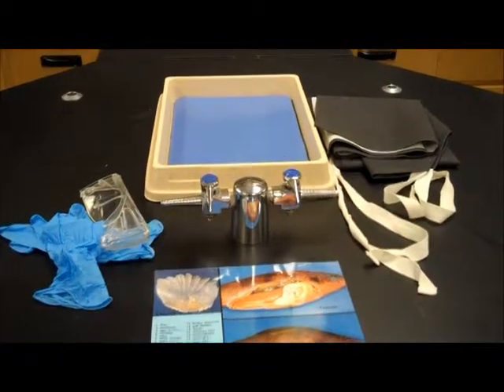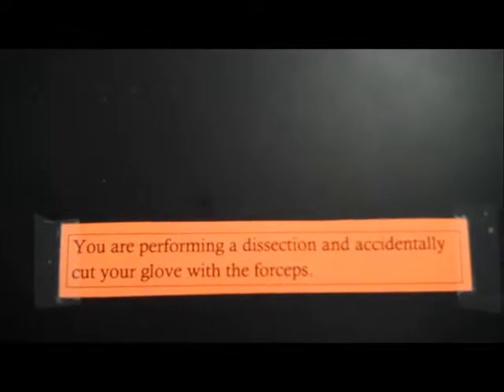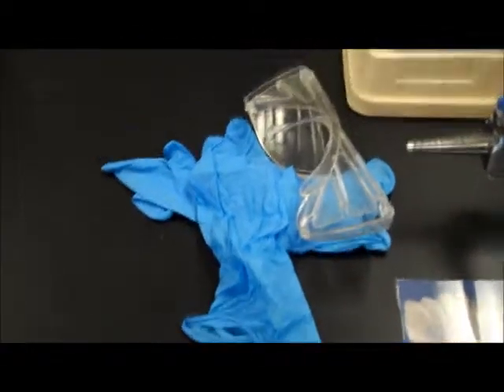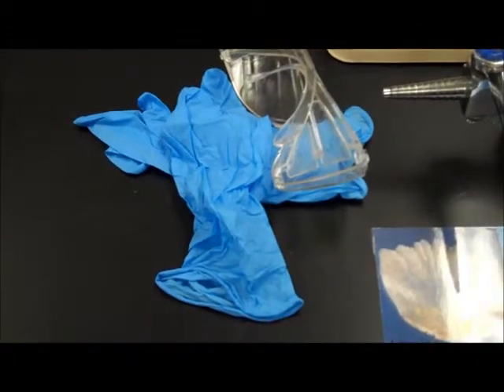In the second situation, you are performing a dissection and accidentally cut your glove with the forceps. Forceps are like tweezers. They look like this. And when you're dissecting, you're always going to use gloves because there are chemicals that you don't want to get on your hands that are in the animals for preserving them.